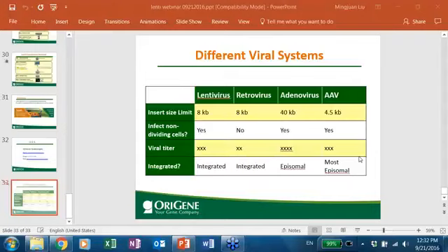There's a customer who seems to not have gotten the point. Why should we use a third generation virus? Okay. The third generation, because it's safer, because of the deletion at the 3' U3 region. So after integrating into the host genome, your target cell, the deletion just makes the virus unable to replicate at all.